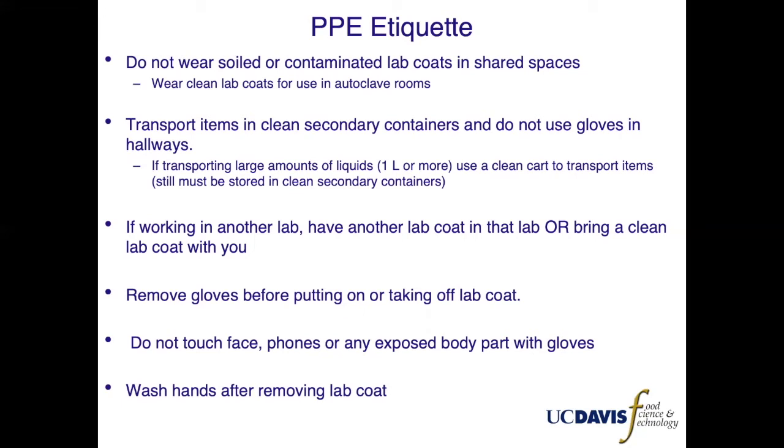Doing this contaminates the inside of your lab coat and therefore any part of you touching the lab coat. Do not touch your face, phone, headphones, or any exposed body part with gloves. Doing so can contaminate your skin or personal items with any of the hazards you have on your gloves. Wash your hands after you remove your lab coat.